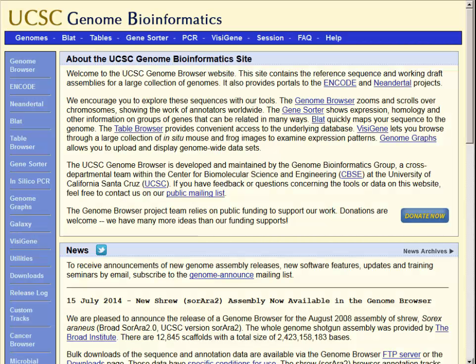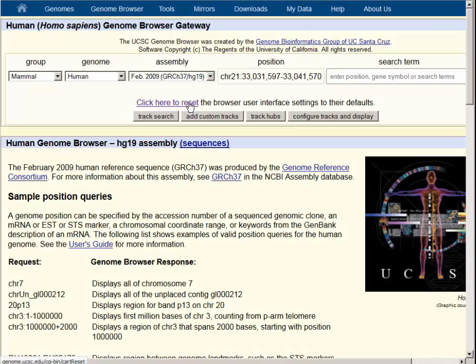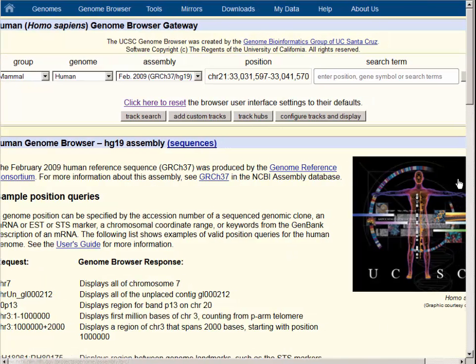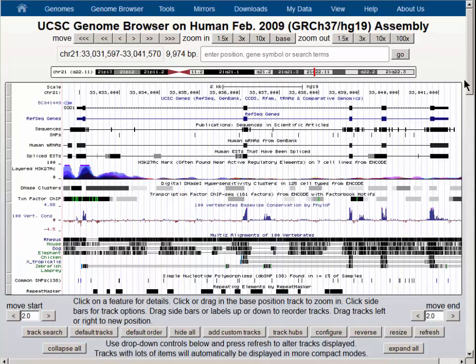This is the main index page. In the upper left-hand corner are two ways to get to the main browser graphic. Click here to reset. We'll set the browser to the default location and the default sets of data. Using the submit button on the right-hand edge of the screen, we'll go into the main browser graphic.